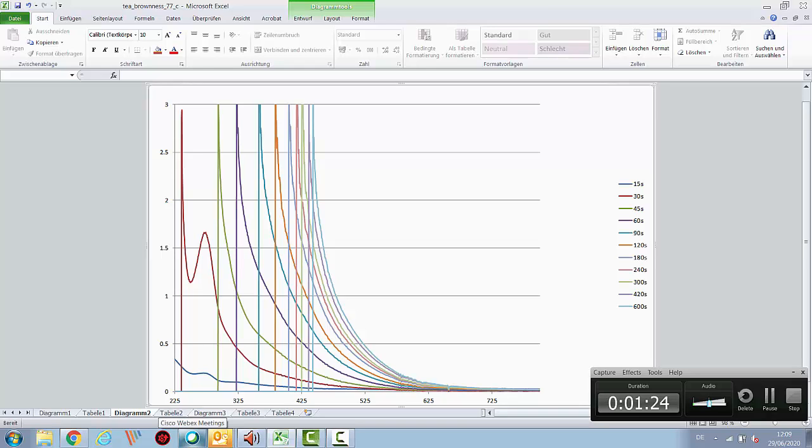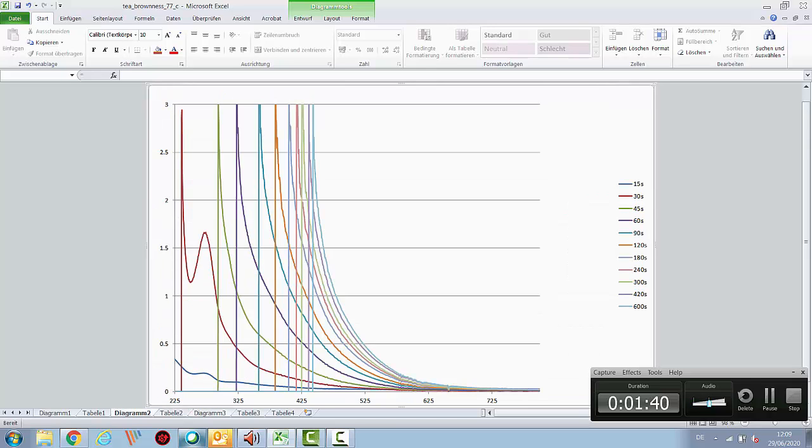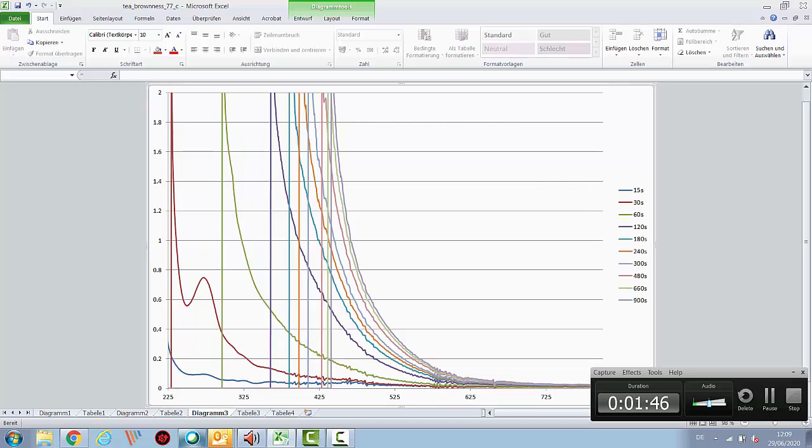If we increase it to a third temperature, or actually decrease it to 65 degrees centigrade, I think it is, we get this measurement where they're somewhat lower. So if we compare that one with the one before, look at the red curve, that's at 85, just over 1.5, and at 65 it's less than half of that after 30 seconds.